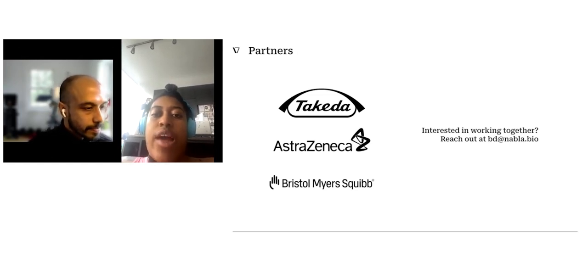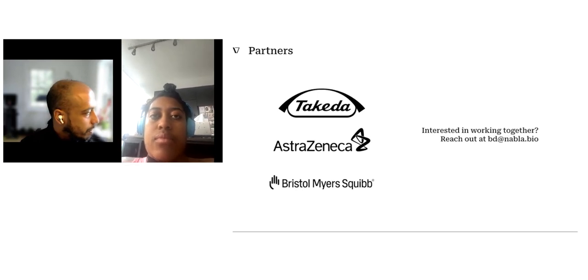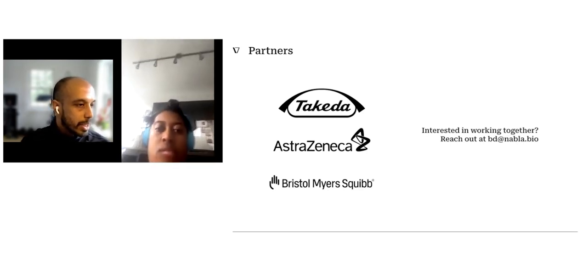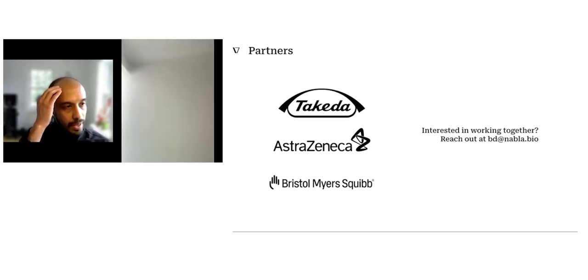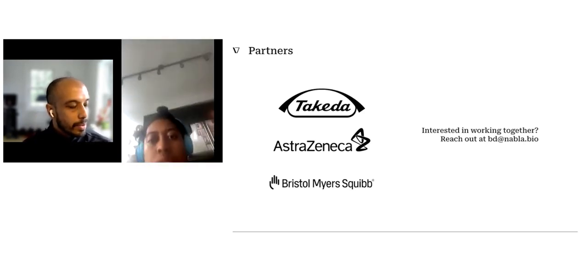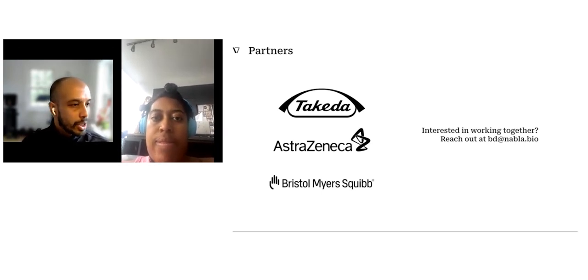Did you try doing pull-down experiments with lysed OVCAR3 cells to test the specificity further, or any other complementary experiments to confirm specificity? We did not do that. The main thing that convinced us we were binding the target was the overexpression cell line experiment. We had an overexpression cell line expressing native Claudin-4, and then a clean KO, and it wasn't binding that KO cell line. So we felt pretty good based on that result. And then the OVCAR was just to show that it would generalize to another cell line.